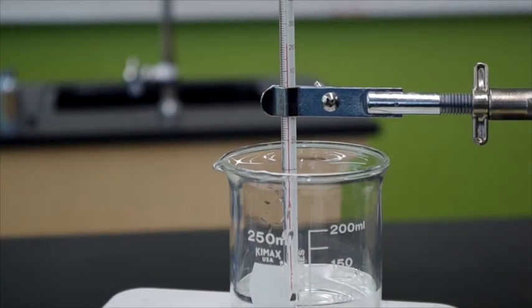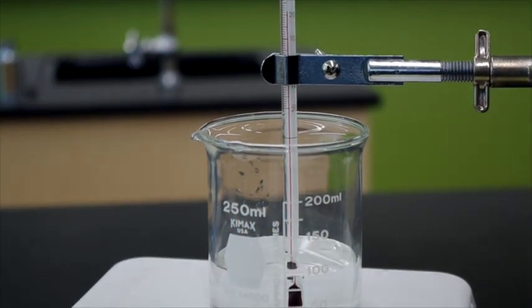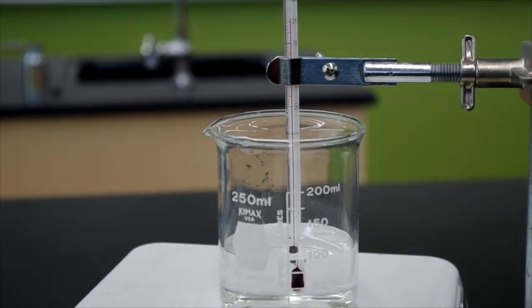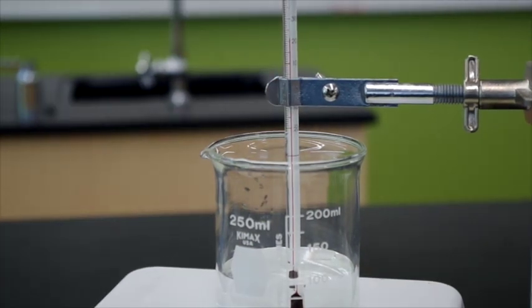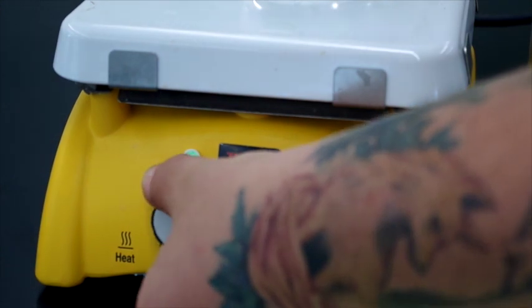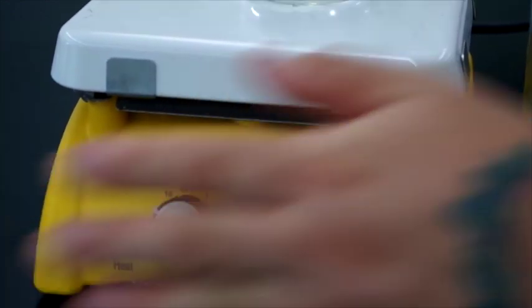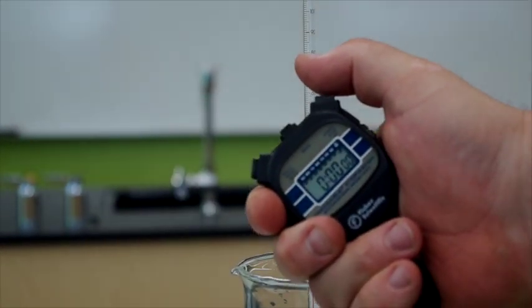But we notice that the water is also 21 degrees. We turn on the hot plate. Just want to go down to it real quick. Put it all the way up to the top. Now go back up. We're going to click the stopwatch. Is it in focus?